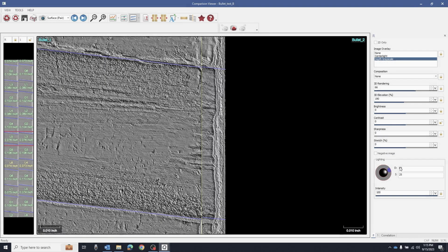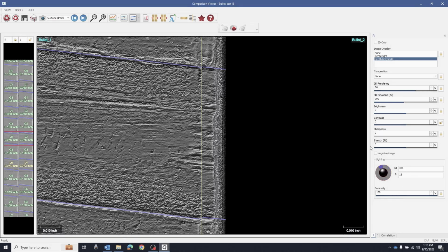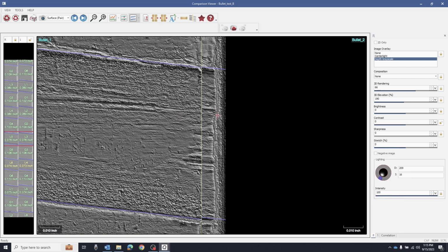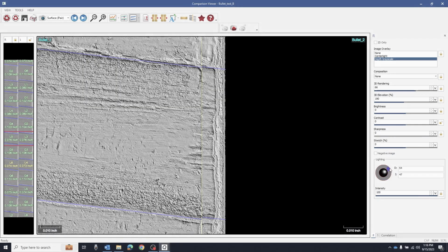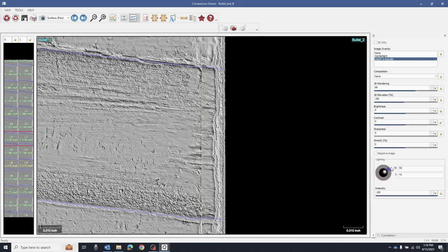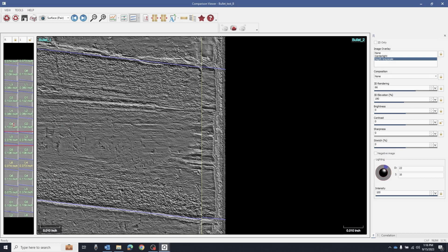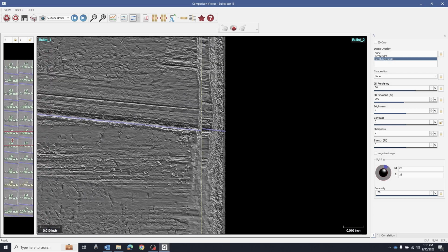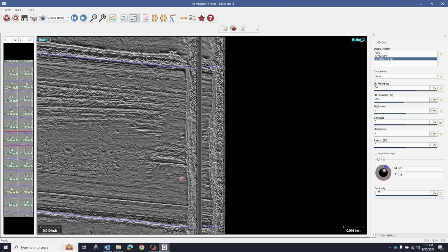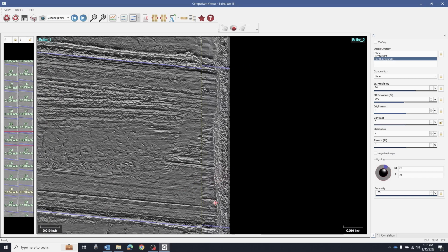And again, play with those shadows and see where the light now, that single light tool is moving in unison on both sides there. Both items are being illuminated by that degree and angle in real time. And so I'm seeing things happening in harmony between both items. And I want to see when things react at the same time in the same coordinates. Keep moving this around. Let's go straight to Lee 4 to Lee 2. Lee 4 is well marked. Lee 2 seems to be as well.